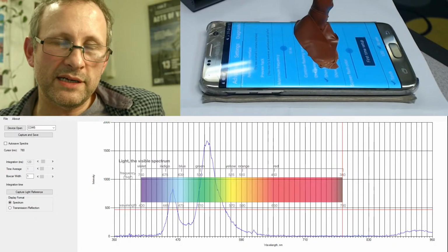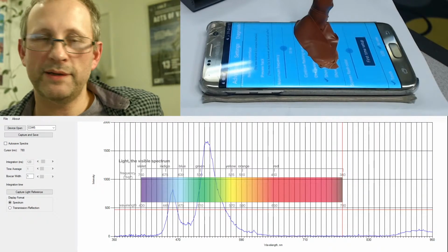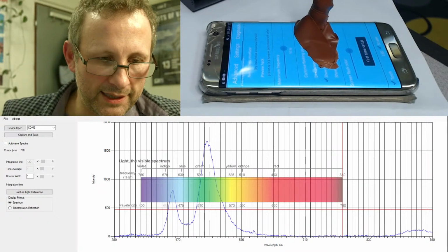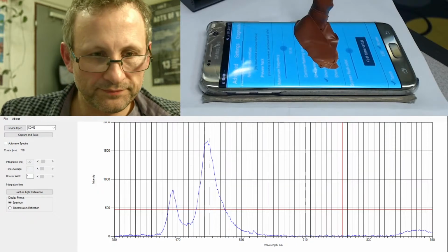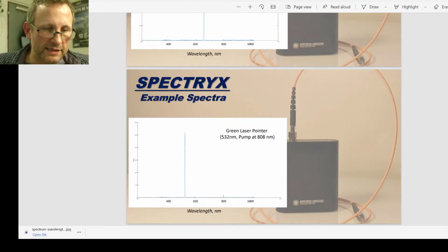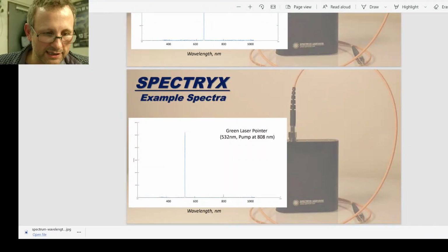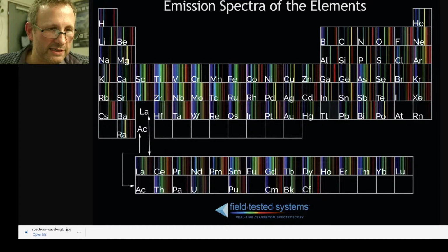Yes, there is software to determine what elements there are. If you go to the PowerPoint presentation here, you can see that if you have a very specific line being produced, then it will produce a very, very sharp signal. So if we were to, for instance, produce sodium, let's say, for whatever reason, you would have this very strong line here. So certain elements produce very good signatures.